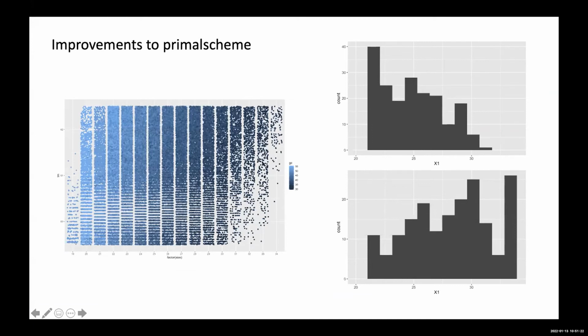And what we've done here is we've modeled the length of primers which have the suitable TM for multiplex PCR, which is actually 60, or I think here we've got 59.5 up to 62.5. That's the sort of allowable range that we use for doing multiplex PCR. Very, very tightly designed TMs to allow them to work in the same reaction.